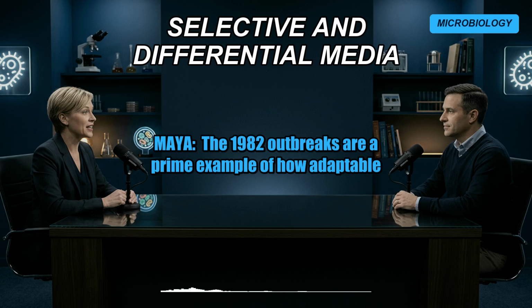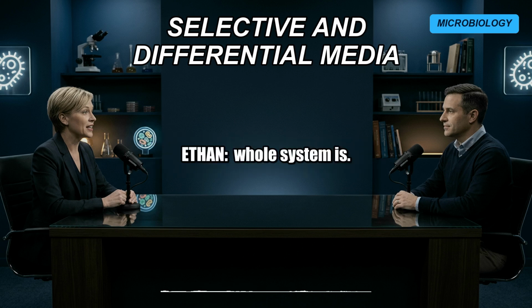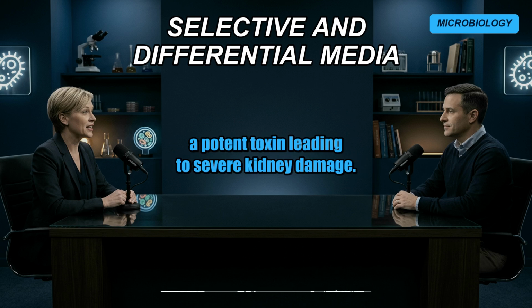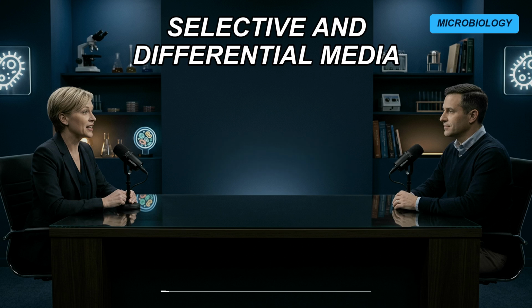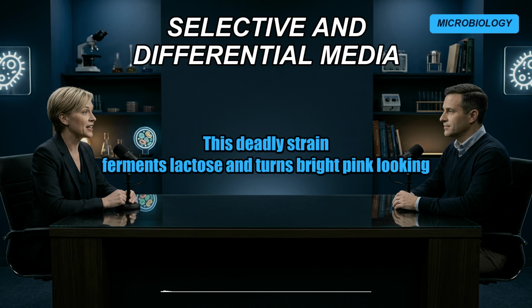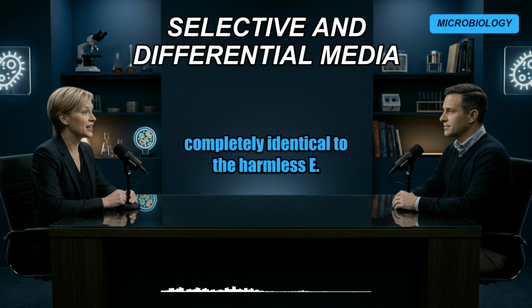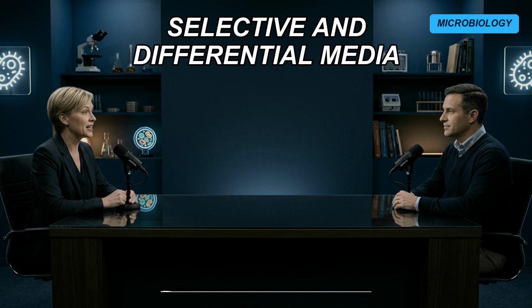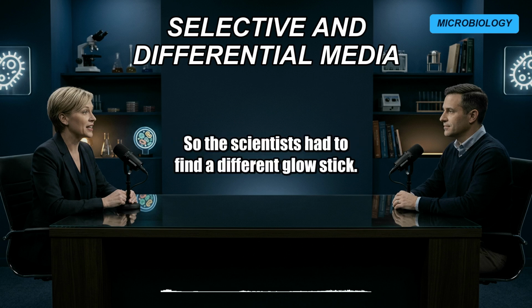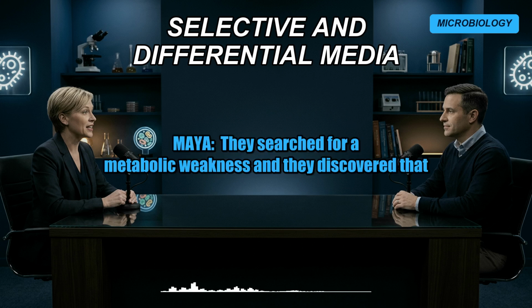The 1982 outbreaks are a prime example of how adaptable this whole system is. E. coli O157:H7 is a highly dangerous strain that produces a potent toxin, leading to severe kidney damage. But here was the problem for microbiologists on a standard MacConkey plate. This deadly strain ferments lactose and turns bright pink, looking completely identical to the harmless E. coli that already lives in everyone's gut. So the glow stick was giving the same color to the harmless crowd and the killer. Exactly. So the scientists had to find a different glow stick. They searched for a metabolic weakness, and they discovered that while normal E.